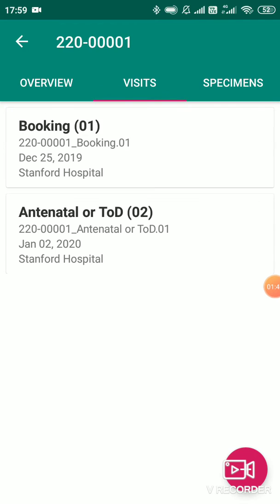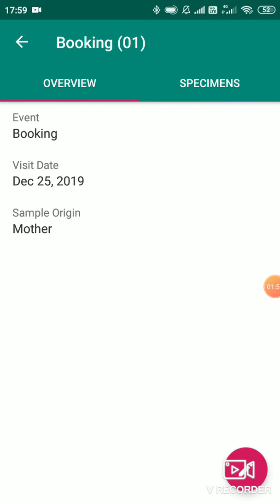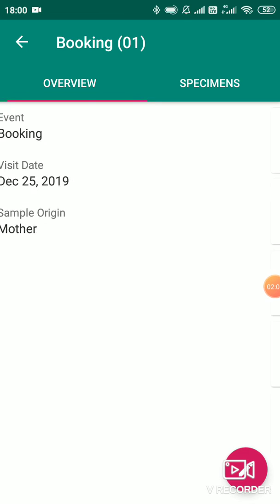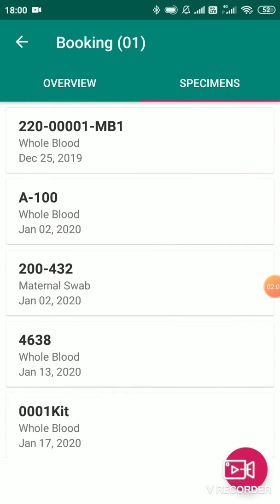I'll show you one of the existing visits here — that is booking 01. This visit occurred on December 24, 2019, and the sample origin is mother. After the visit, specimens come into the picture. To collect specimens, just swipe right and here you can see the specimens.